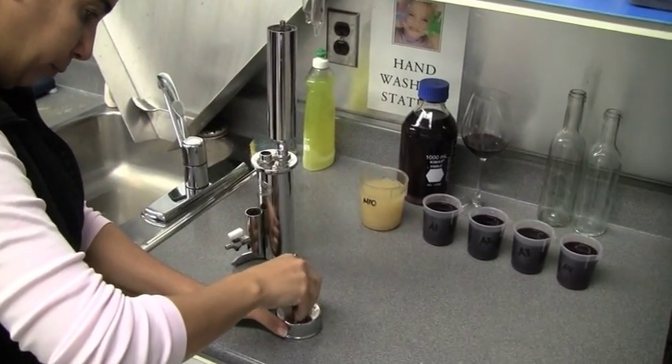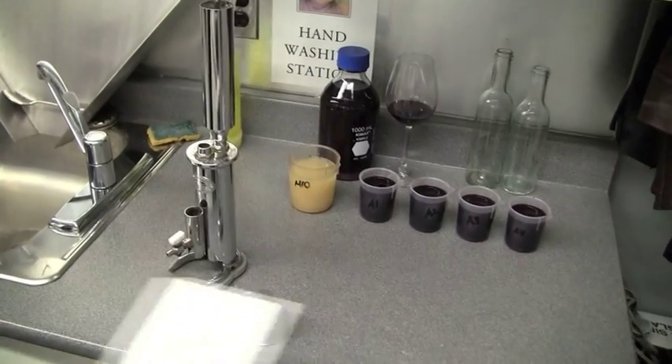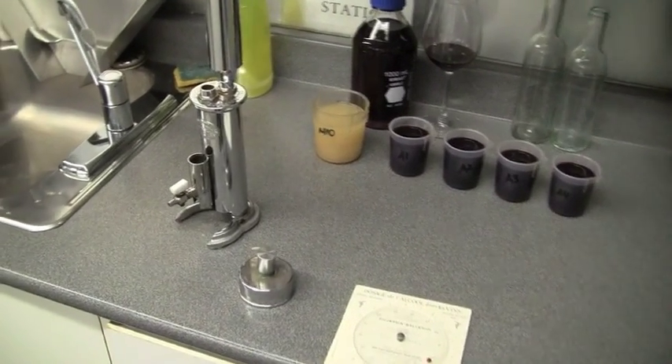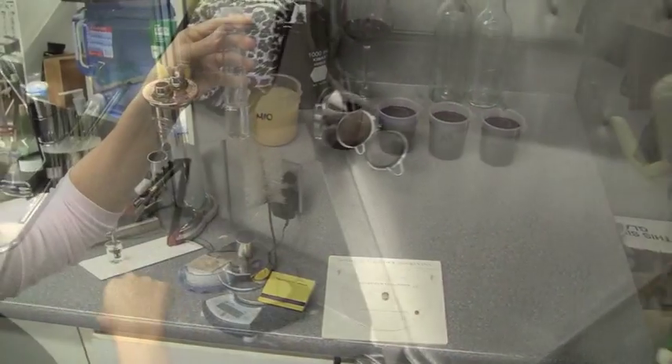It is an old device that we have used for decades. Basically what it does is it looks at the boiling point of water — which you're all saying is 100 degrees Celsius. Kind of, but we'll get back to that. And it compares that to the boiling point of the wine.